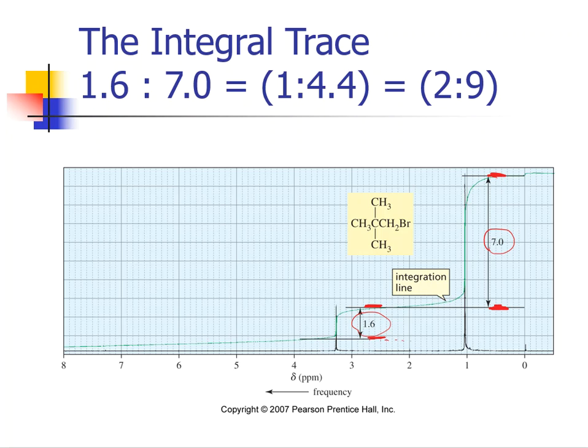All right, so if we go across, you're going to see that this very first line that's drawn here is almost in regards to the TMS signal. That's where this line starts, right? And then this particular line is going to start right at the top of that signal where it maxes out.